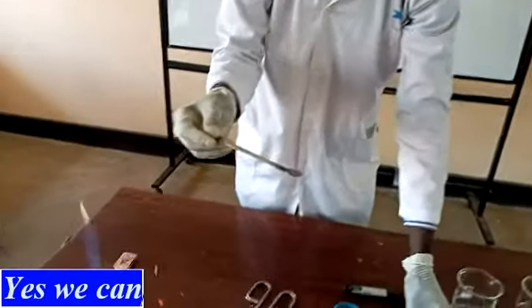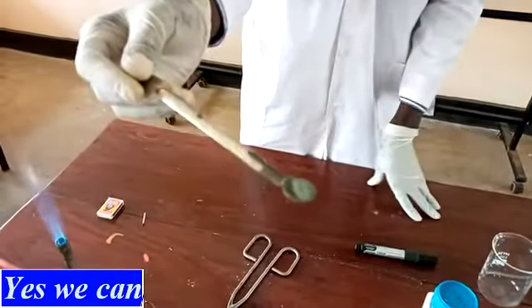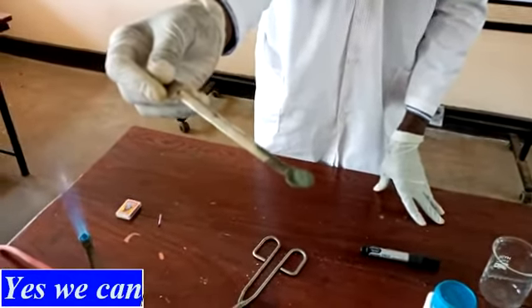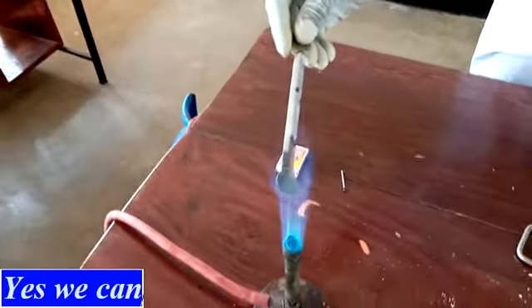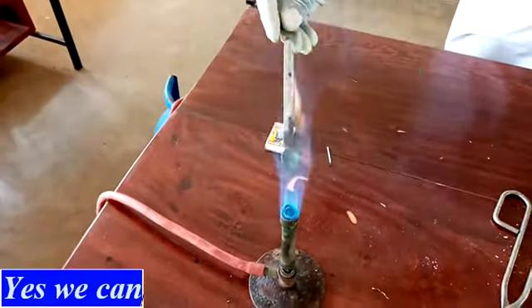So that is zinc powder. Look at the color. Good. So we are going to burn this zinc in presence of air. Note the color of the flame and the color of the product.